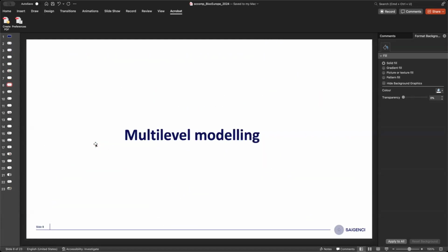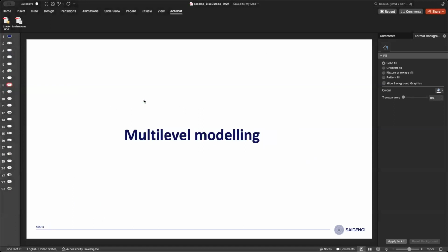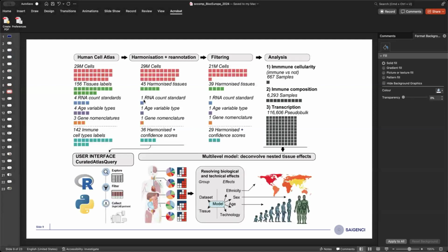I don't have the code here. Let me see if I should change my screen again. Sorry, maybe I can show just briefly to you here. When you call it, you give this cell group column, and cell group could have any value, could have 1, 2, 3, or T cells, B cells, and so on. I will show you then how the count table looks like. It could be intuitive, but actually it is not shown there.